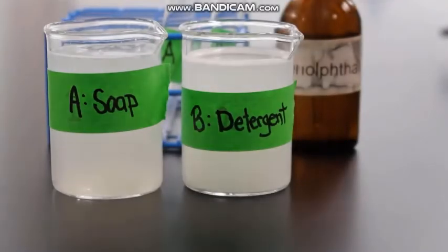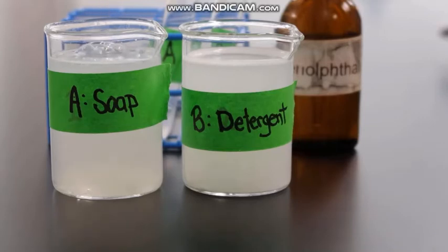For part C, we will be comparing the properties of a solution made from our lab-made soap to a solution made from a commercial laundry detergent.